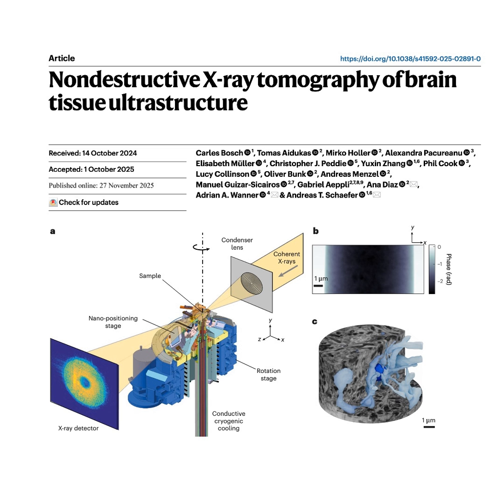But TGPAP has something extra. It has a crucial upgrade. It includes a benzene ring and a tertiary amine group. And the hardener they use with it, called DDM, also has multiple benzene rings. And these benzene rings, these aromatic structures, what do they do functionally? They dramatically increase the rigidity and the density of the final polymer. Think of it like swapping out cheap plastic scaffolding for reinforced steel rebar. I see. These aromatic structures, when they're packed together, provide extraordinary mechanical strength and, crucially, phenomenal radiation resilience.